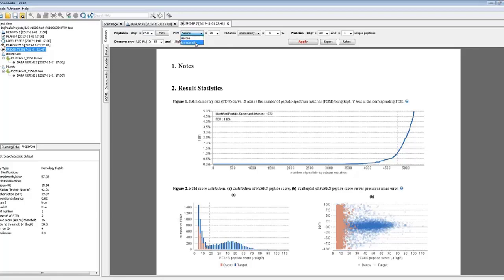Or if you use ion intensity, that requires that you have matched ions showing fragmentation before and after that modification site of at least, say for example, 5% relative intensity. Or you can set a filter specifically to the mutations, so single amino acid variants as well.